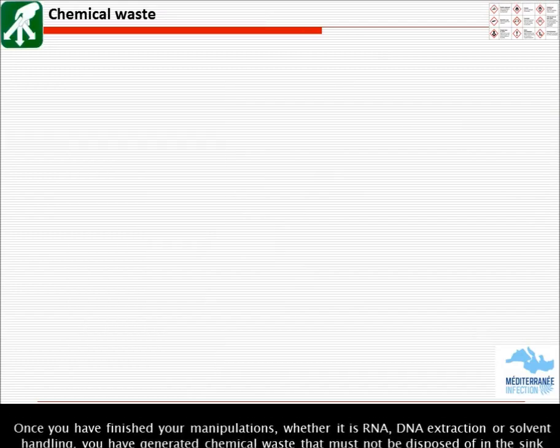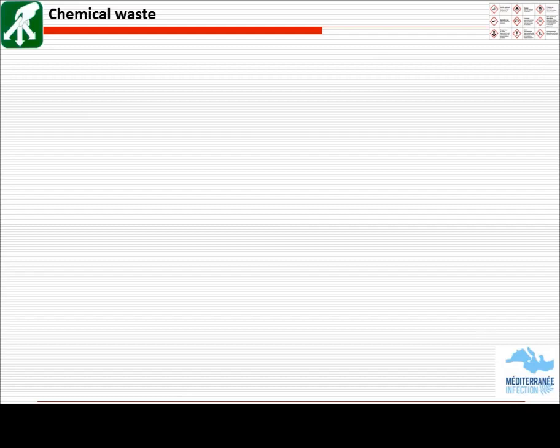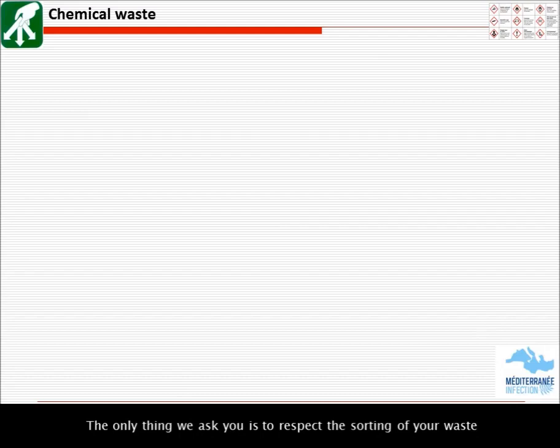Once you have finished your manipulations, whether it is RNA, DNA extraction or solvent handling, you have generated chemical waste that must not be disposed of in the sink. In the Institut Hospitalo Universitaire, we have everything that we need to eliminate these chemical wastes. Specialized companies evacuate and treat them every week. The only thing we ask you is to respect the sorting of your waste.